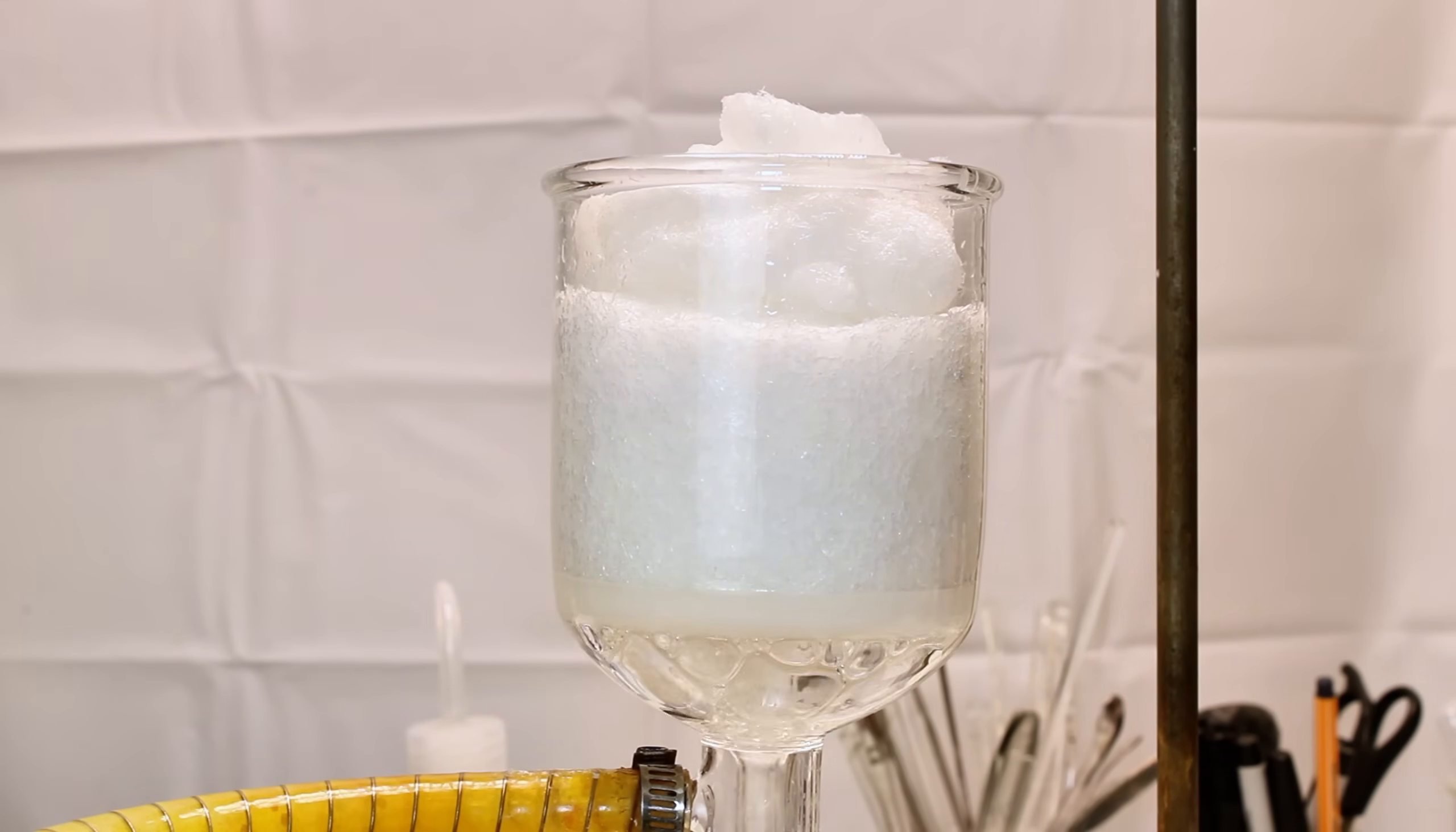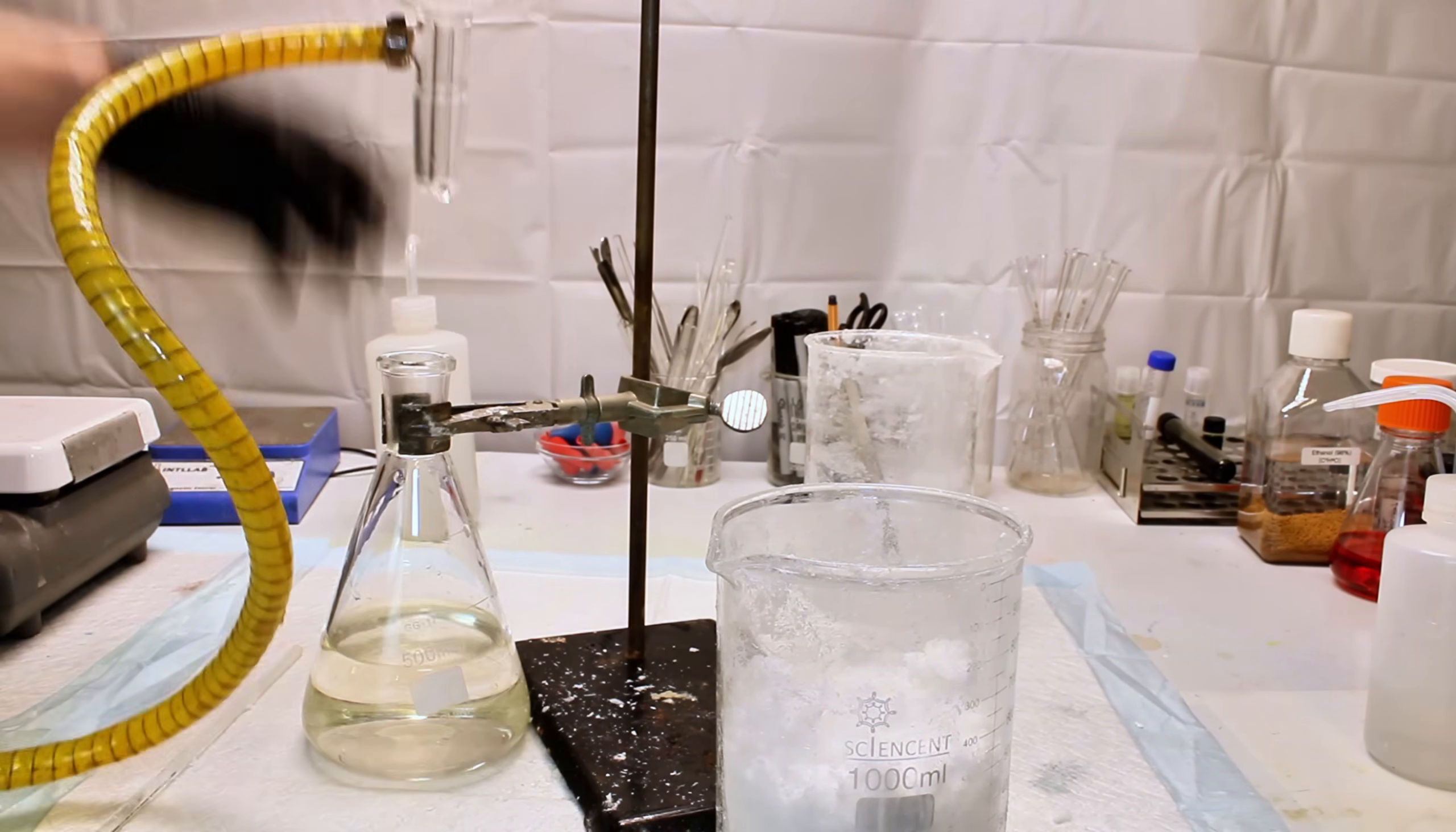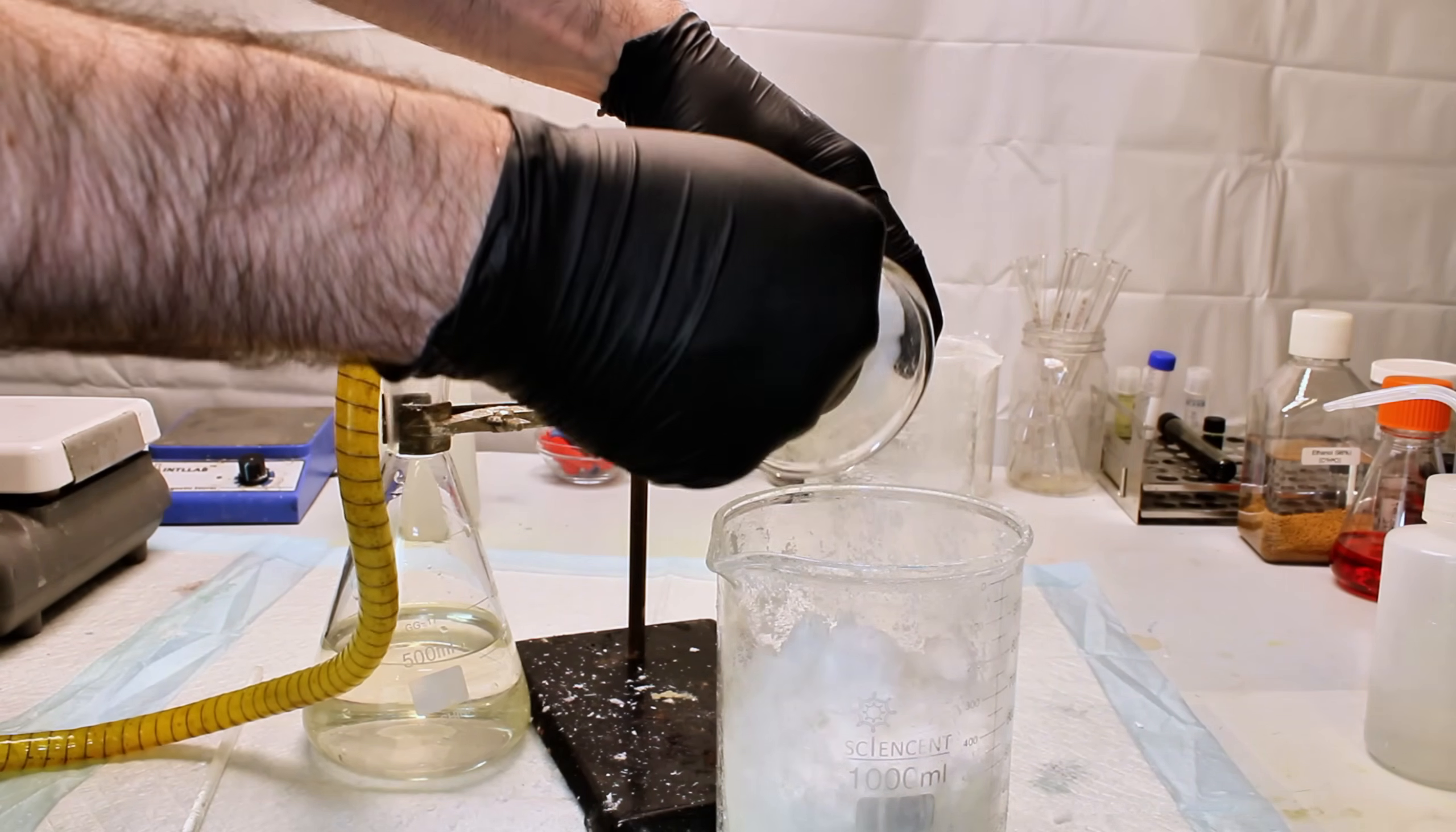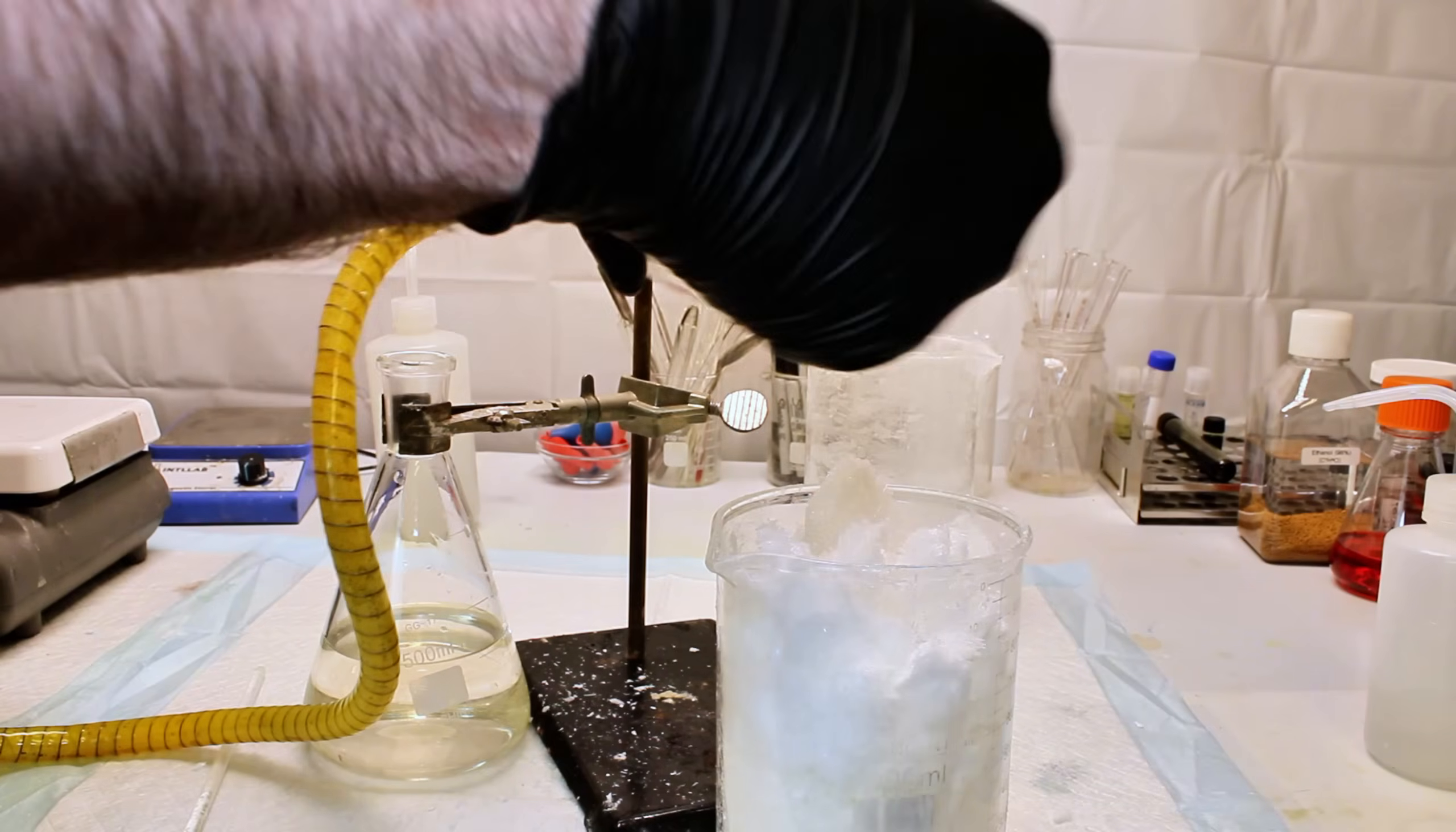After the urea crystals have been collected, they now need to be dried. The issue with this is that excessively high temperature will cause urea to decompose, which in addition to destroying your product will produce a lot of toxic ammonia gas. Not only is this a problem, but urea tends to be able to re-dissolve itself in its own residual moisture if you try to heat it, and this will result in a solid, unworkable mass.